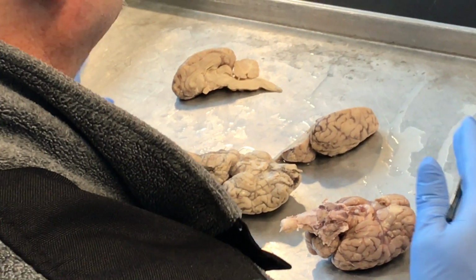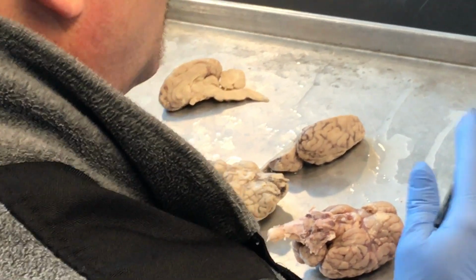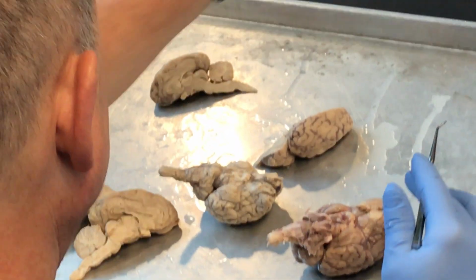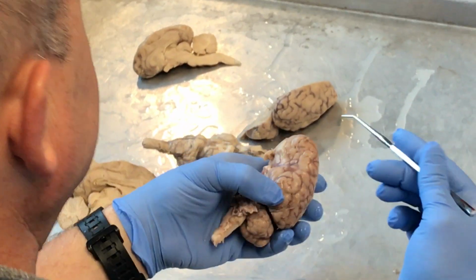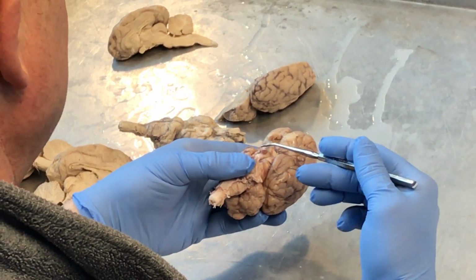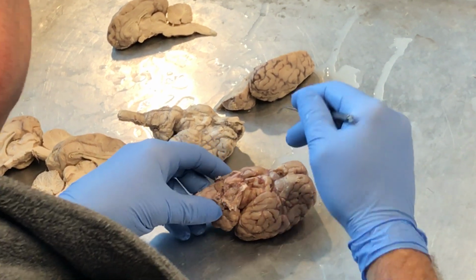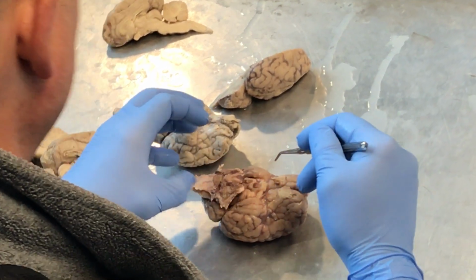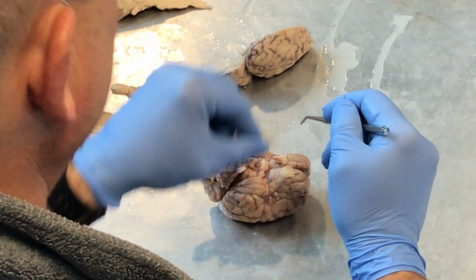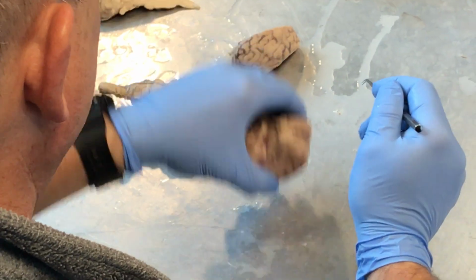So here's what we will do for lab. The lab test. On the sheep brain proper, like the picture you have up above, we will test you on either the olfactory or the optic on the sheep brain. But here's the problem. The TAs in the past are like, oh, that's a great trigeminal. We need to do trigeminal. So they put a pin in the trigeminal. You guys start moving around, and these things will dry out pretty quickly.